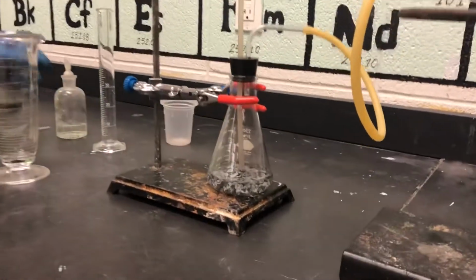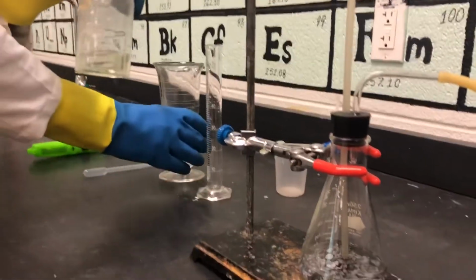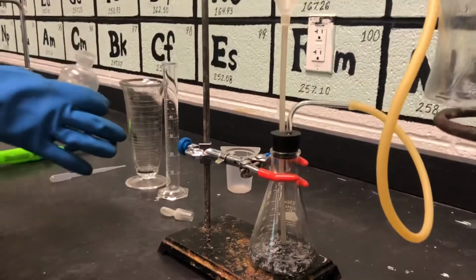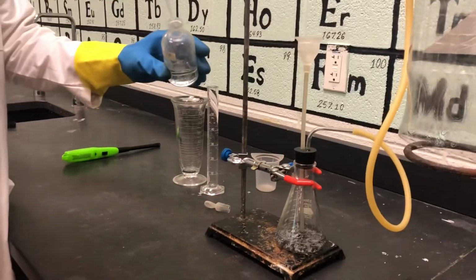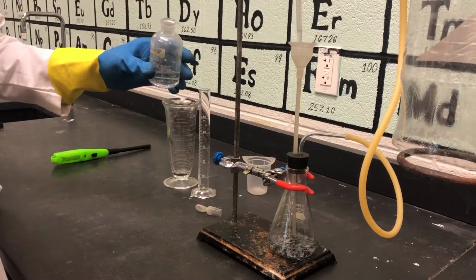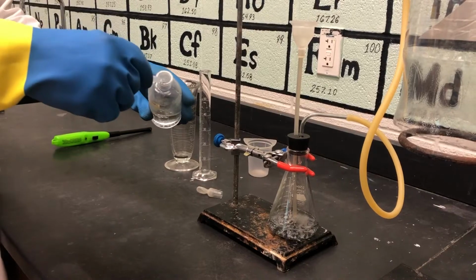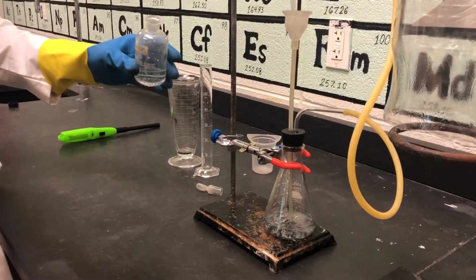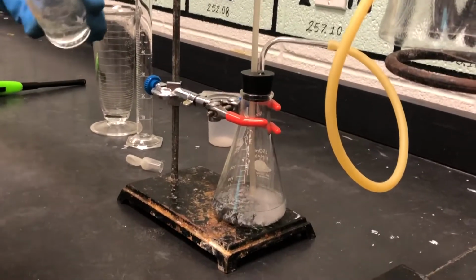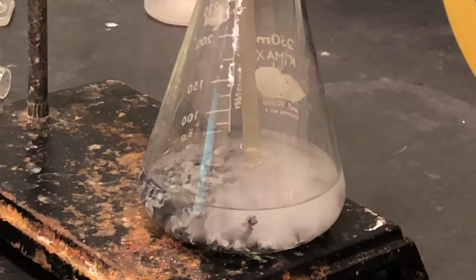I've got hydrochloric acid here, and we're going to be adding that, and we have to add it in amounts that we get a reaction that is sustainable. So you can see each time I add some hydrochloric acid to that, I'm adding in about 2 and 3 milliliter increments.